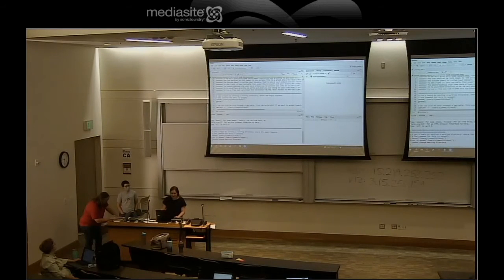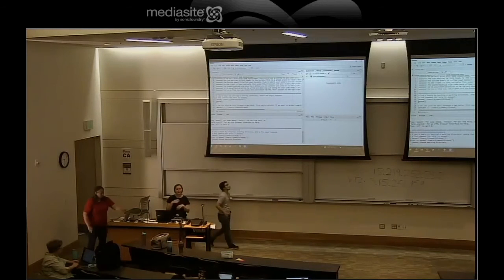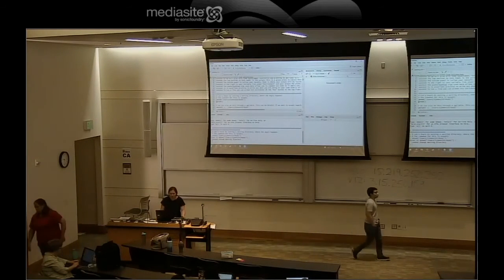So your working directory is kind of where all the magic happens. It's literally where you're actually doing your work in R. A lot of times I will use my working directory also as an output directory. So I'll work in that directory and then say, okay, save all my stuff to my working directory, and then everything's there. I know where all of my stuff is. Does that make sense to everybody? It's like going to a folder and making a file in that folder. In other words, make yourself a working directory and then set it to that. A lot of times I'll make my working directories usually on my desktop and then move them later so that I can find what I'm actively working on.